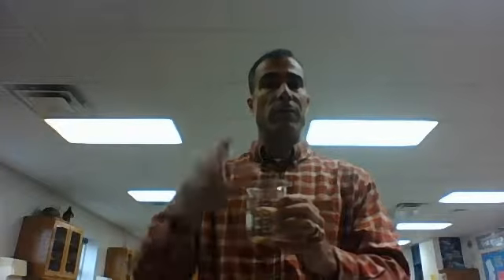So, to start out with, I have a beaker. A beaker's a container that is used for measuring liquids. You can see that there's markings on the side, measurements in milliliters. So you use this for measuring certain amounts of liquids, and these come in different sizes from very small, like 50 milliliters, up to even 1,000 milliliters, which are much larger. So that's a beaker.